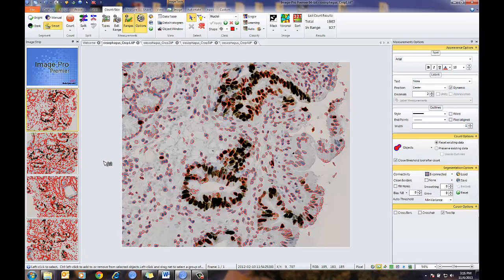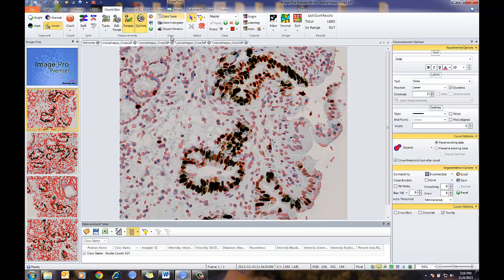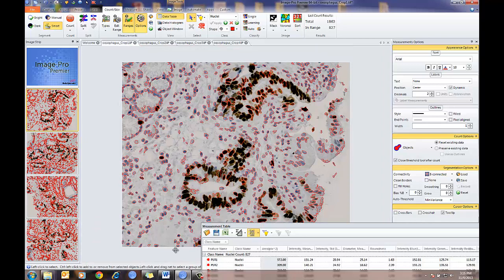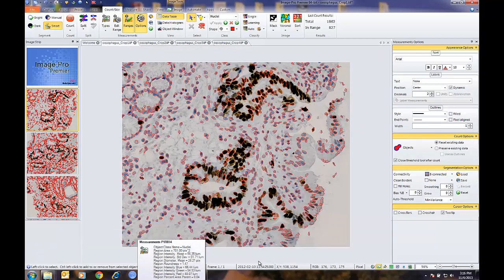One important thing here is I'm just building the set — this is not really the full analysis. Normally, using our new cell analysis app in ImagePro Premiere 9.1, I'll be counting the nuclei located in certain structures. But for the training set, I'm just going to select nuclei that are already represented within these structures and then apply those settings. I have my nuclei already counted, and I can see the data by pressing the data table. The key right now is I need to classify them.